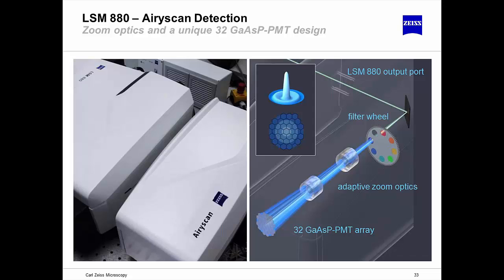All of these assumptions about the sensitivity of a confocal were based around one somewhat false assumption, which was that the pinhole is 100% sensitive. The pinhole is as good as it can be. And partly these assumptions come from the fact that the pinhole hasn't really evolved in the past 30 years so much.